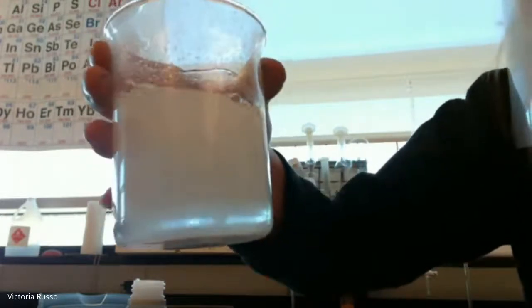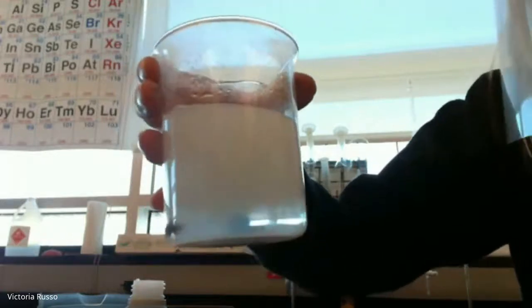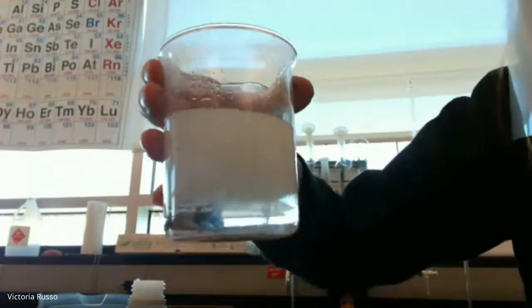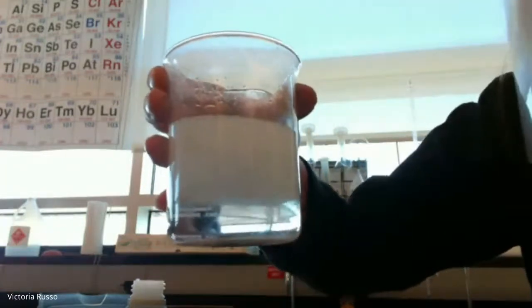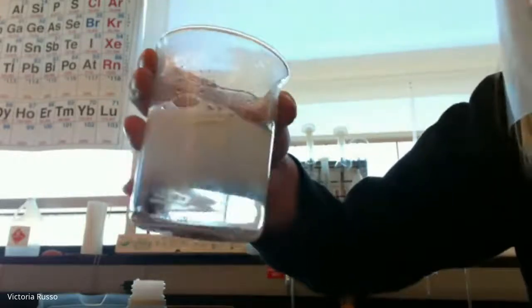And this will react until, it depends on which one's in excess. Is the magnesium metal in excess, or is the acid in excess? I would guess the acid is in excess, but I'm not going to make you sit here and watch this. But again, it's bubbling, and it's producing magnesium chloride and hydrogen gas. That's the gas you see coming off the top, or the bubbles that you see producing.